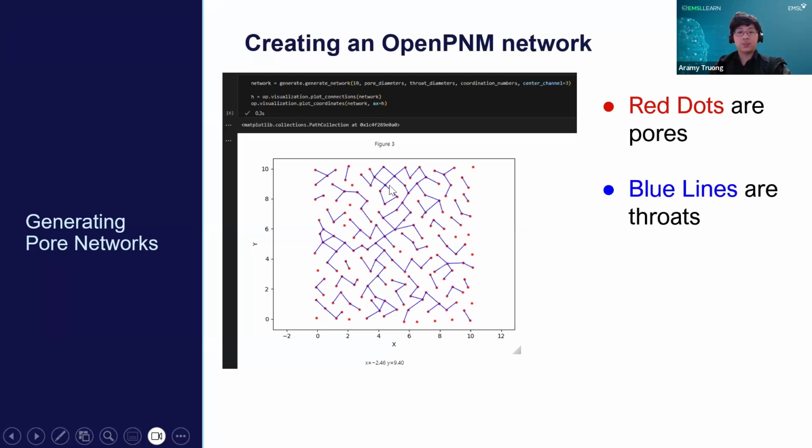And so we see that in the micromodel, there are pores with 4 connections coming out. And that shows that we are capturing the connectivity of the XCT images in the final micromodel. And another thing to mention, the pore positions, these red dots, are slightly randomized to not have it be a perfect cubic shape. You can change that factor to randomize it more or less, or have it as a straight cubic shape if you want. That's just an option that we have with pore2chip.